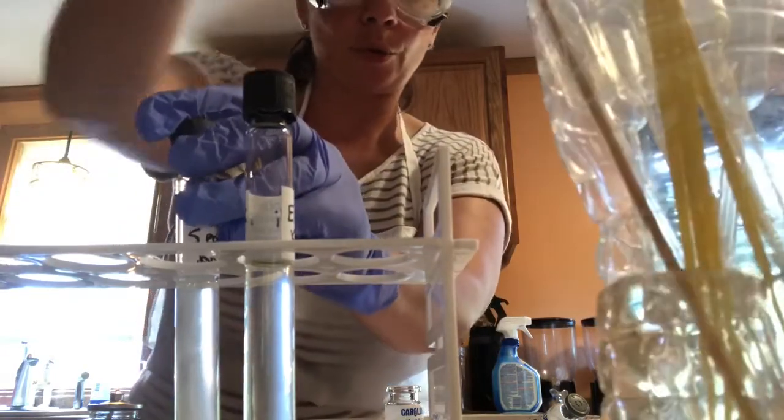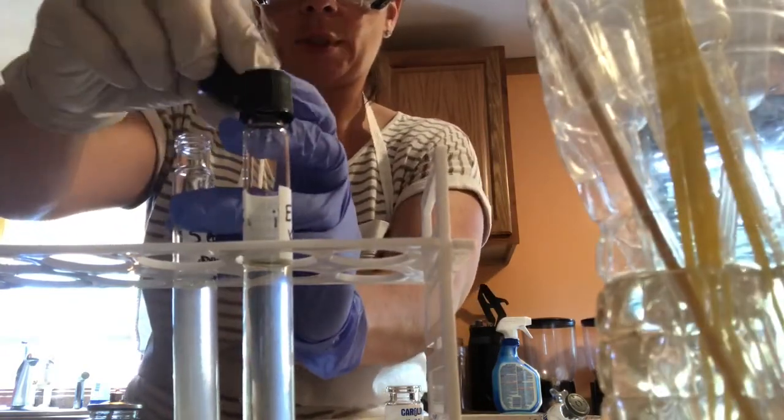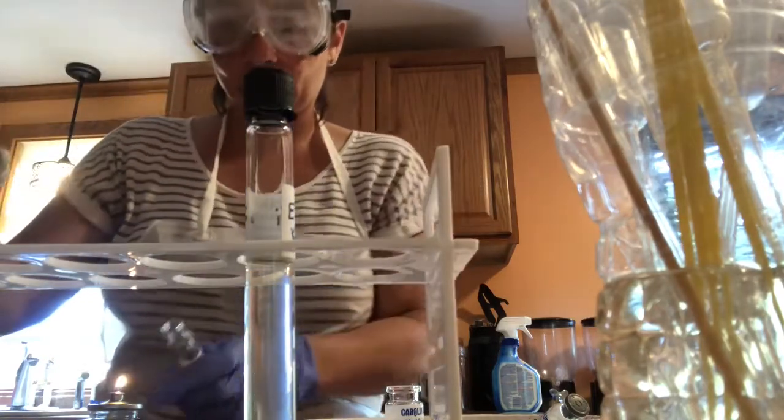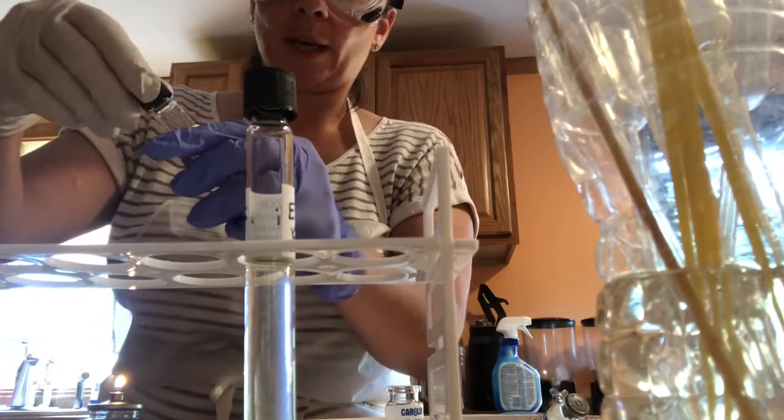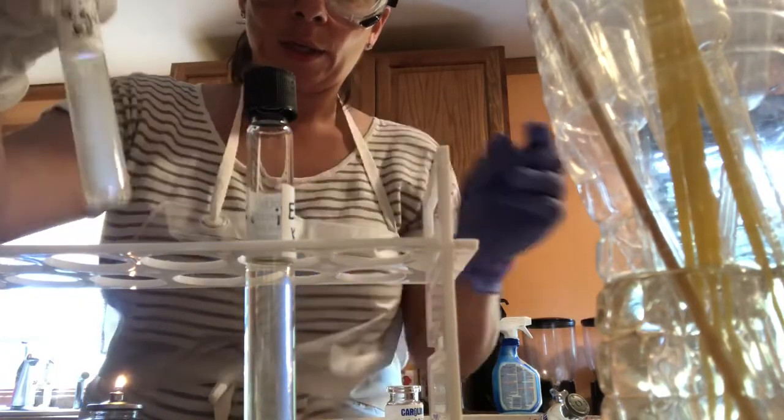Dispose of your tool. Whoops, I did not want to do that with my loose glove. Take this, flame the mouth of it. Okay, put that back on, so tight, and then back one, and put it in here.